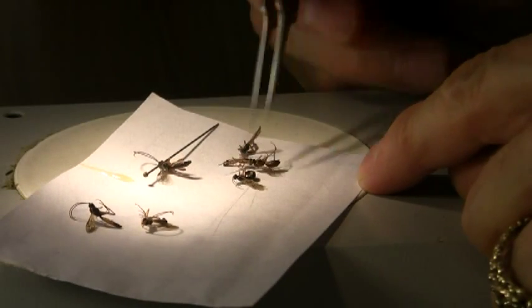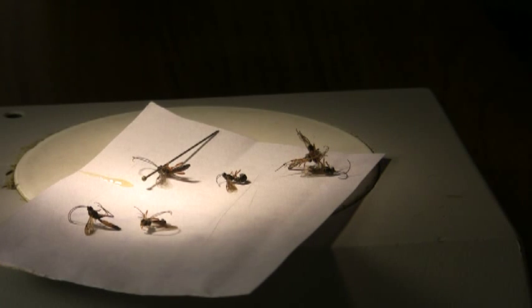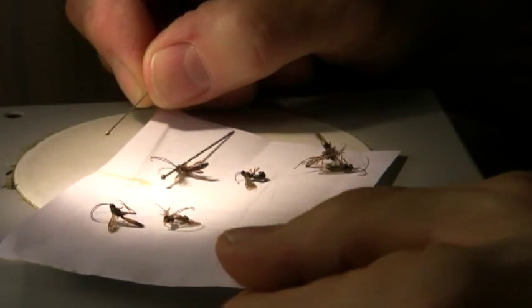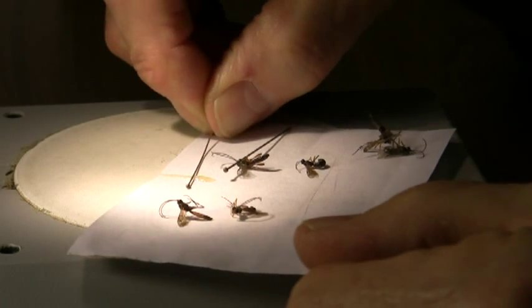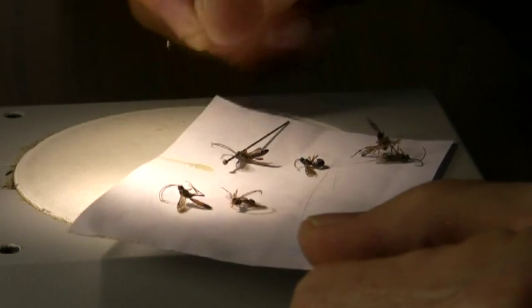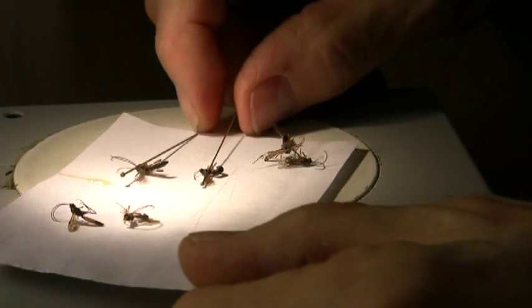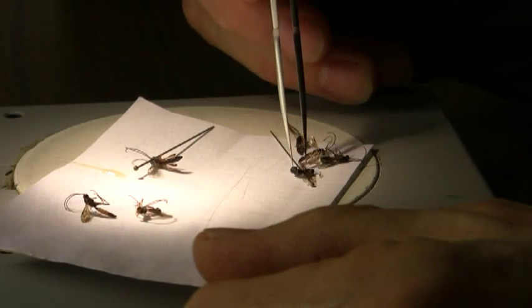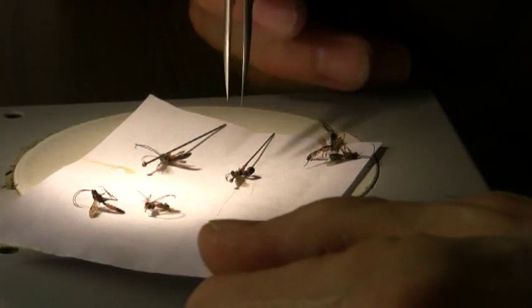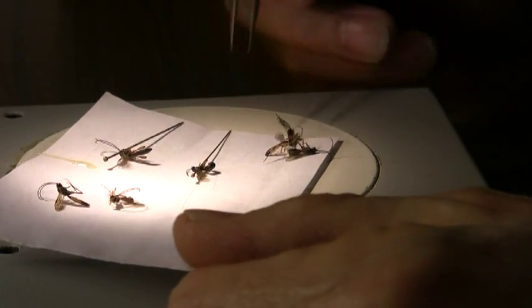All right, we'll do another one while that one's drying up. And again, these can be moved around. Okay, just take another insect pin here. And if the glue starts to get real stringy, then it's time to get some more glue, or even to dilute your glue a little bit. Again, just sticking it on about the right place, moving it over to the specimen, and then touching it on the side, just dropping it there, and then moving it around. Let it sit on the right side of the insect until it affixes nicely.